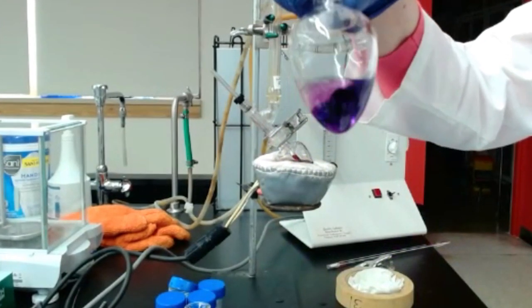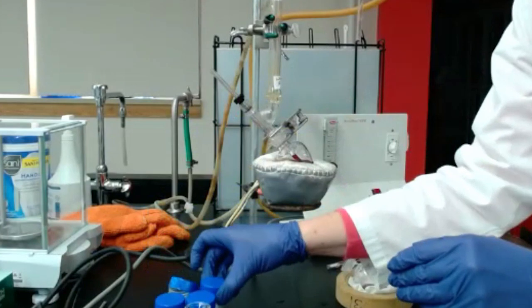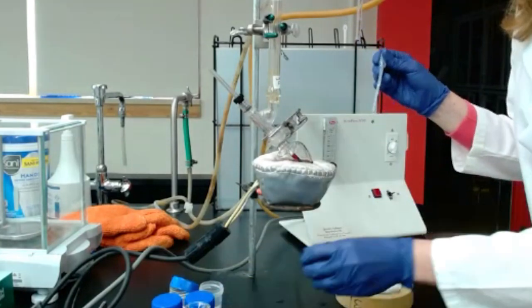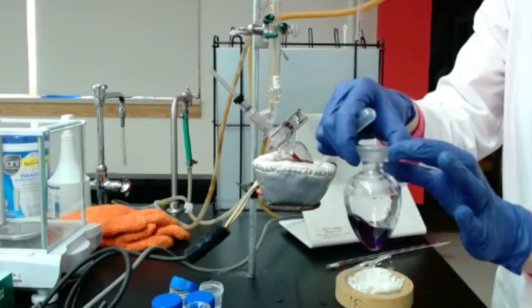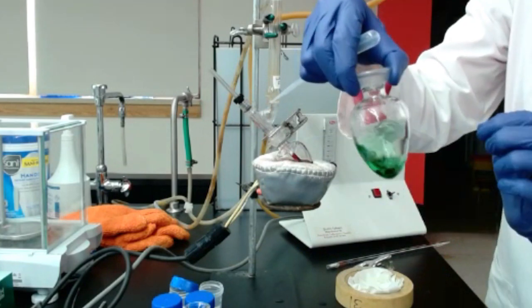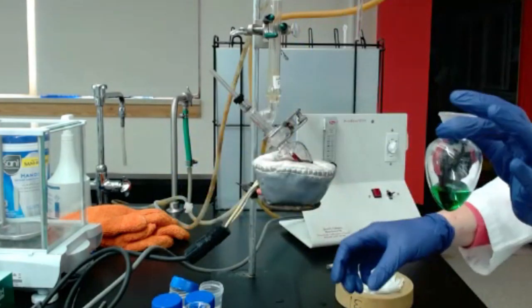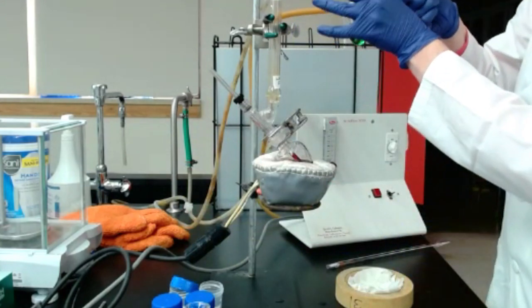So I need to add some sodium hydroxide to make sure it's back to the correct color. I use the same solution that is in my burette for the titration. I use a pipette again, and a few drops. I might need to add more than the color indicator drops. Make sure you stir, and that it's back to pale green. All right. Once you have it ready, you can use the clamp, always hold, and put it here.